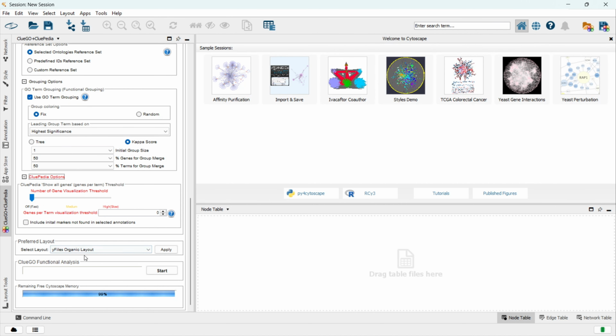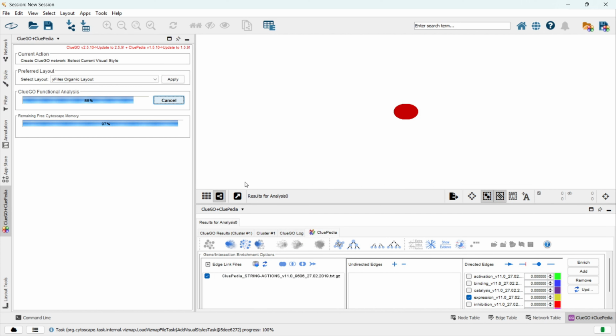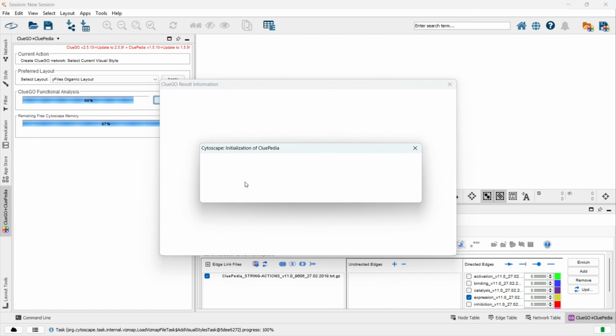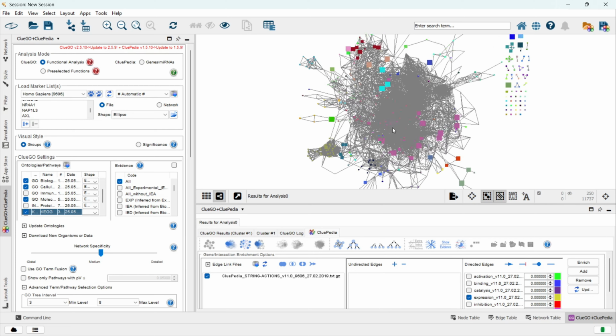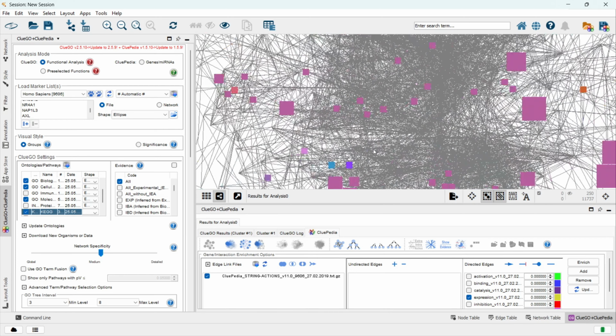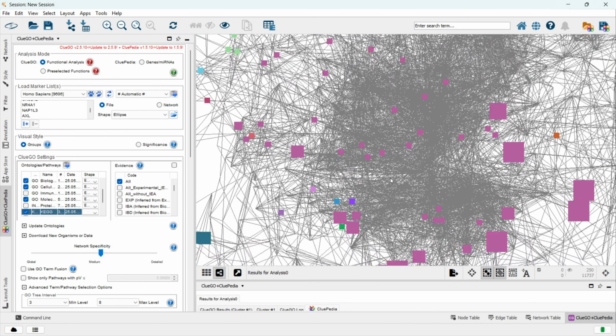Now let's load our differential expression to ClueGO and we'll perform all the ontologies. You're going to select the biological process, molecular function, cellular component, and the KEGG pathways. Now all the parameters we are going to keep in default. Okay, so once we click on start, after the analysis runs, you will see the network visualization show how the genes and terms are connected.